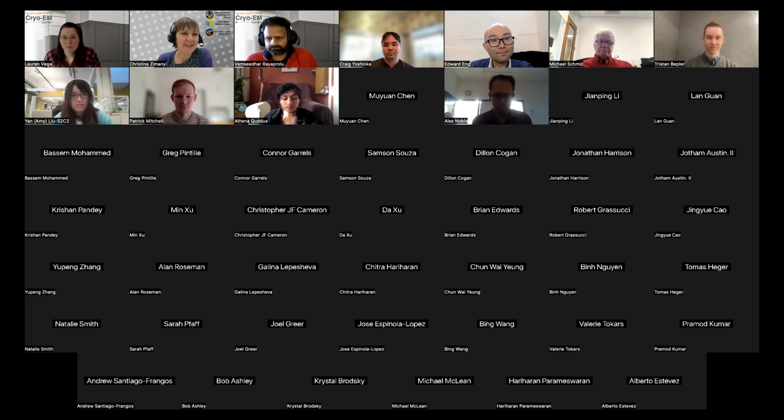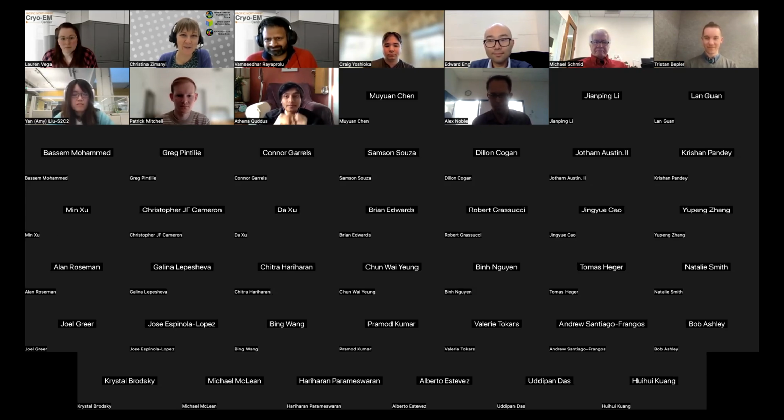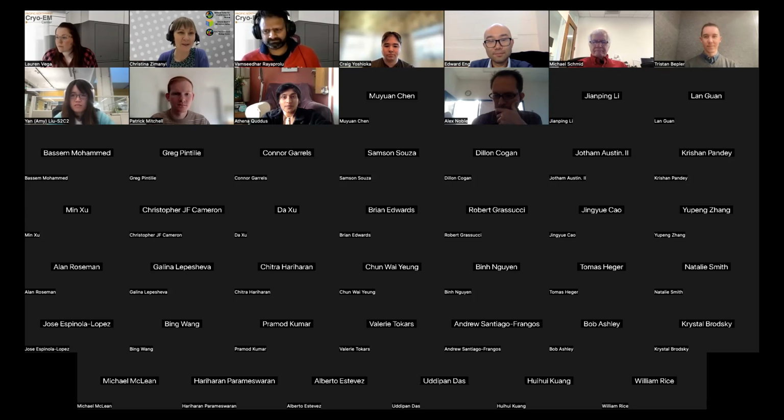Maybe it's a good chance for any of the panelists to share any final thoughts. Otherwise, we'll wrap up so that everyone can get to where they're going. This has been a really fun discussion. I think it turned into a lot more about particle picking generally than anything else, which maybe says something about how ubiquitous neural network picking is. That is just part of particle picking.